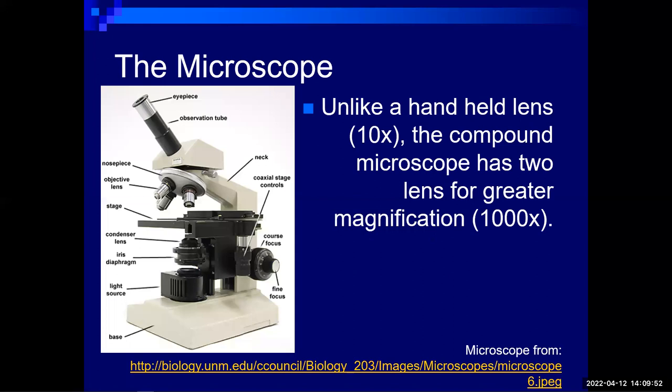Let me just talk a little bit more in detail. So unlike a handheld lens, which usually gives a 10x magnification, 10x means 10 times the original size.